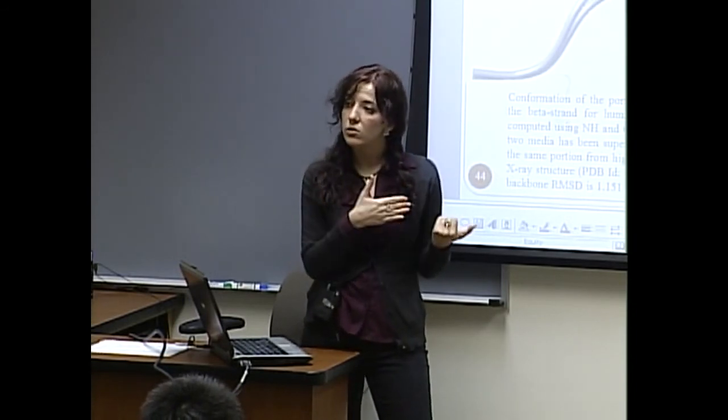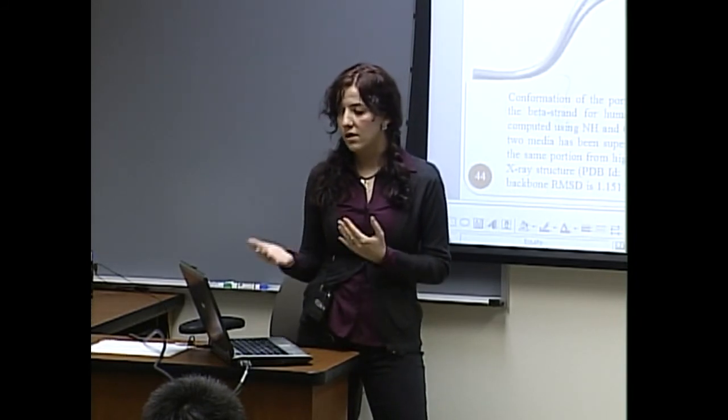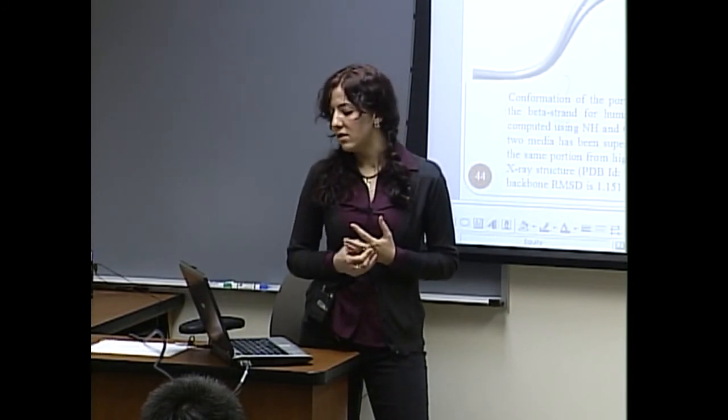And for sure, if there are missing values, for protein portions where not 4.5 residues are given with RDC data, we can already use the estimated alignment tensor for that. So again, the number of equations and the number of variables will be good for solving the system. So that's the strategy, but we haven't implemented that yet. But that's how it was implemented in RDC Panda, where no minimization was used, but just exact solutions.